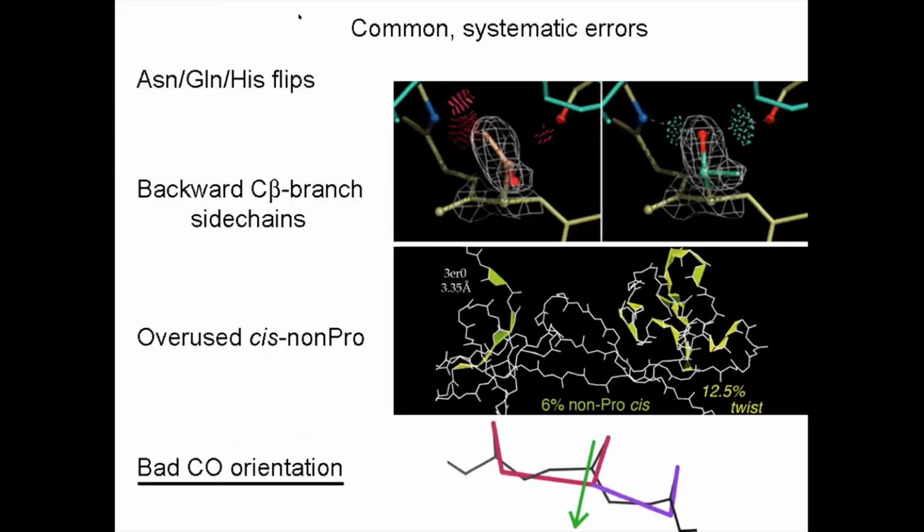So one of the issues that we try to address is that there are some sorts of errors that are just one-offs. You did something weird, there's something very peculiar about your structure that didn't really work with standard methods. But the ones that we try to target are systematic errors where either programs or people do the same wrong thing a lot.